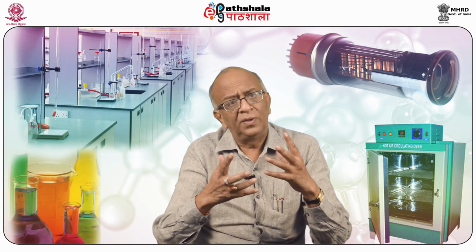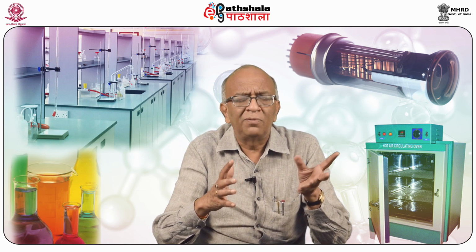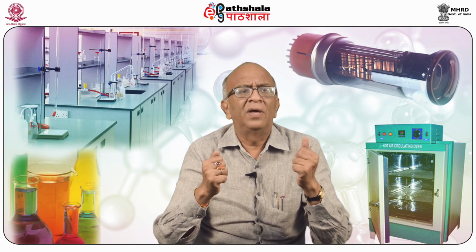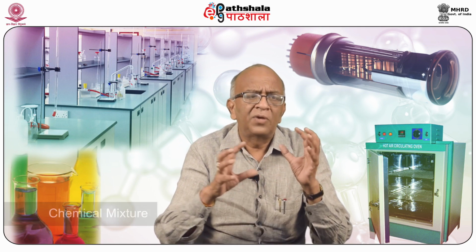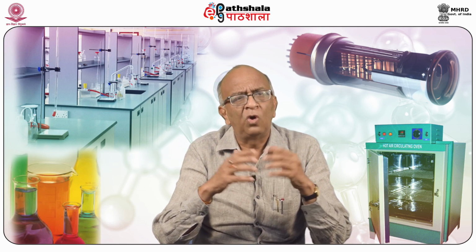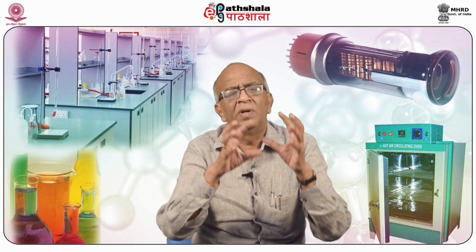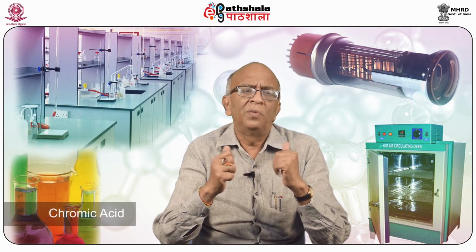But in some cases, there are stubborn impurities on the burette, in the conical flask or on the funnel. Then you have to apply some chemical mixture, and the most commonly used reagent for that purpose, from very early ages, is chromic acid.